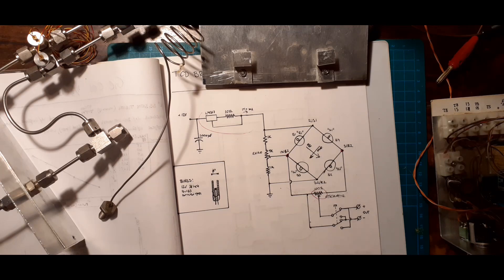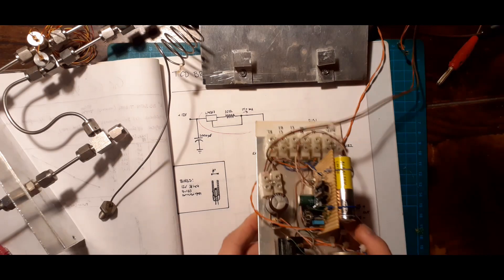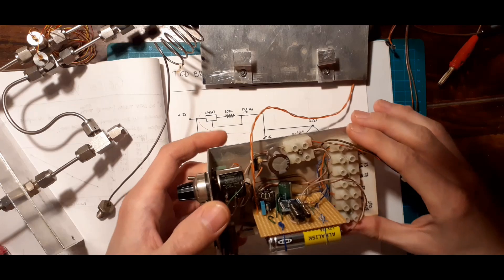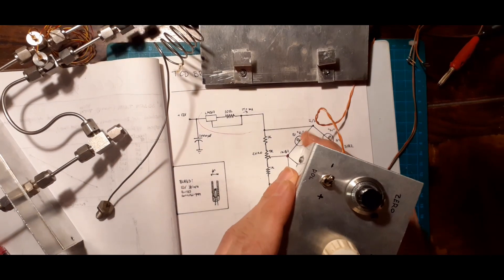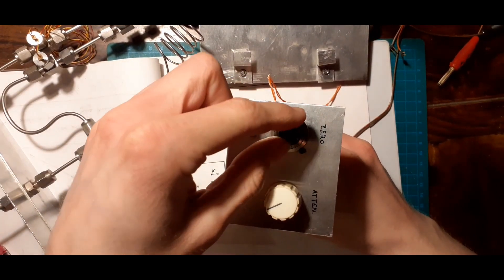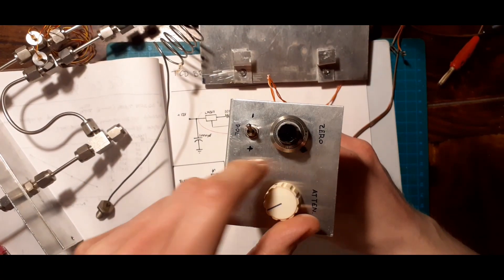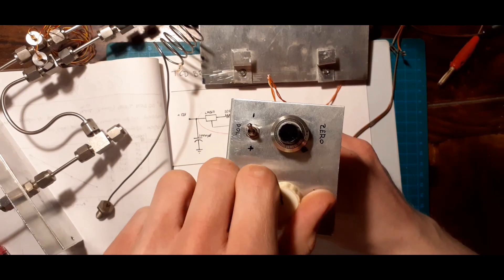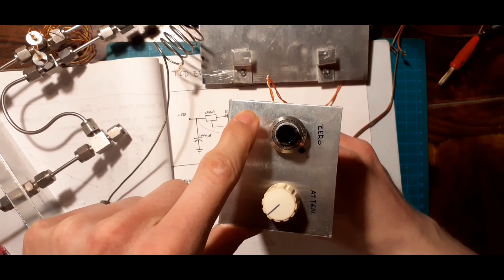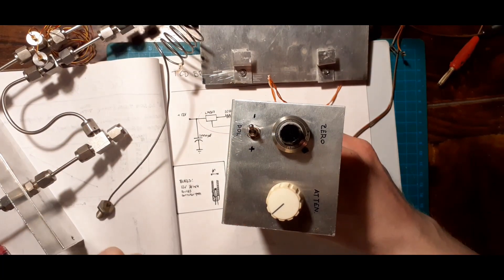Let me show you how this circuit actually looks in real life. I have this here, and you can see the controls here. I have the zero here as a 10-turn pot with a locking vernier scale. I have the attenuator here. I'll be honest, I've never used it. And I have a switch here, which just switches the polarity of the output signal.